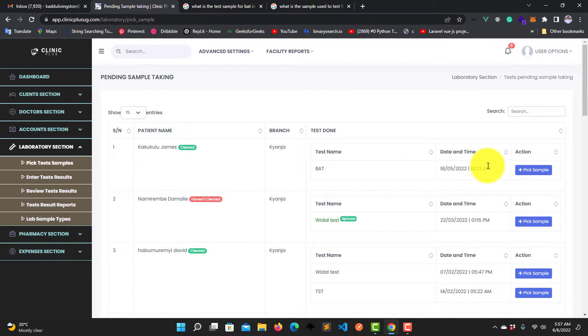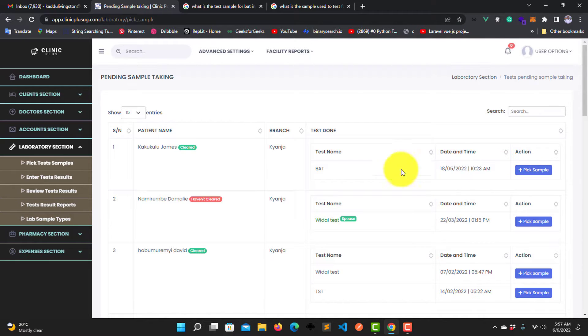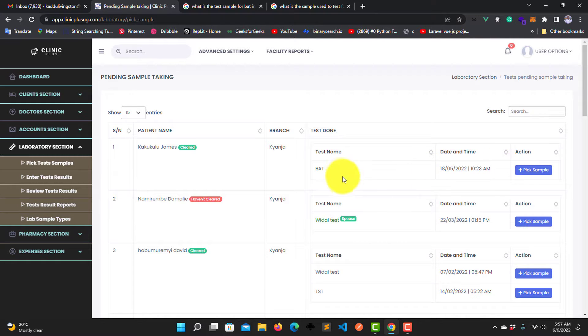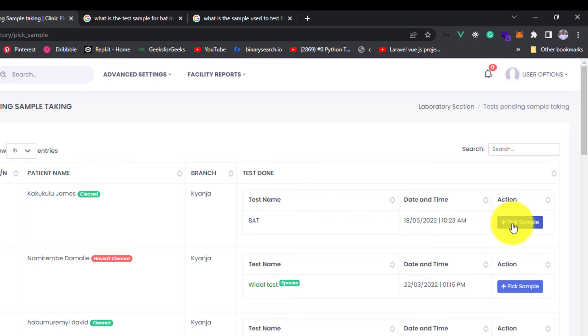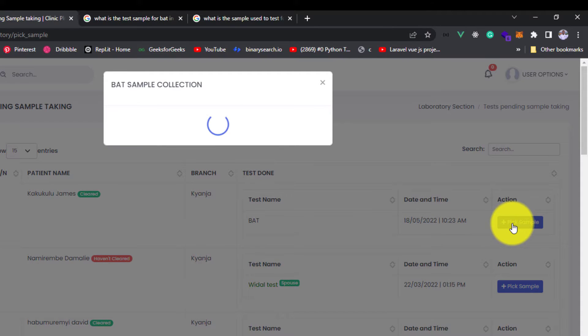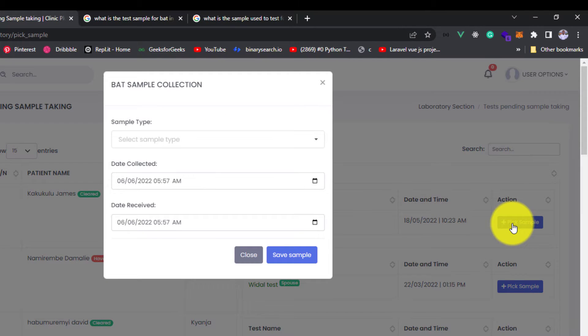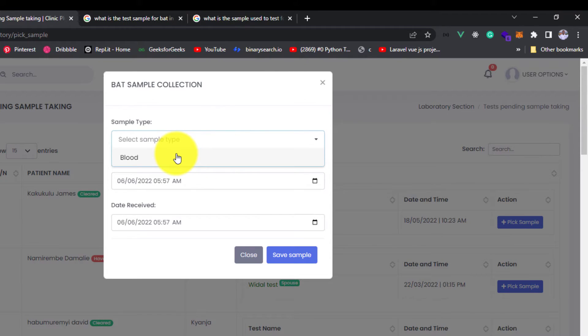You come here and pick a sample for a specific test. Now this one has only one test, so we are going to pick a sample for that test which is BAT. So you click on this button Pick Sample, and when it opens you can pick a sample.